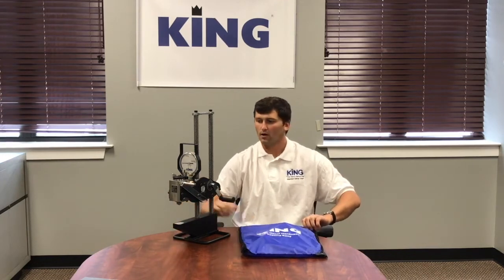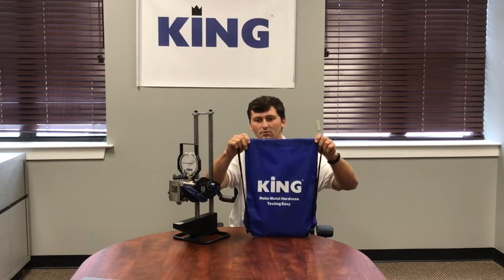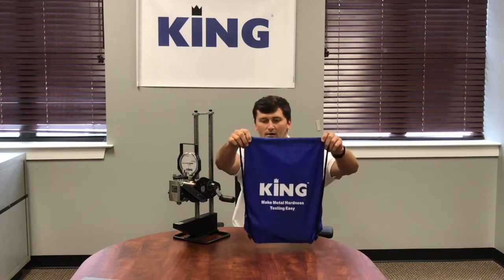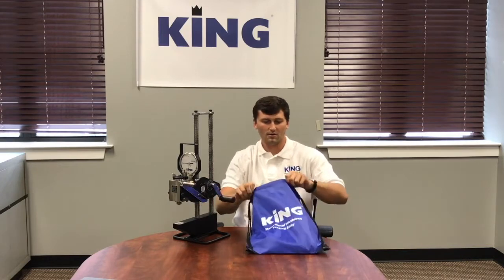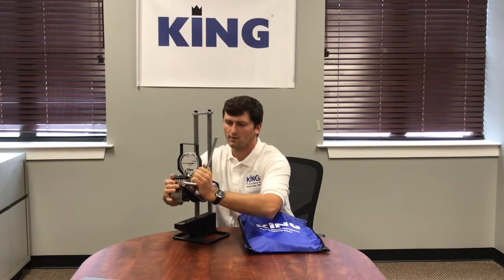We're going to run over that, but first we're going to go over our King Tester bag that also comes with it. Out of this, we are going to have our pump handle first. We'll go ahead and put this on to our pump segment here, and that will just snap on easy like that.